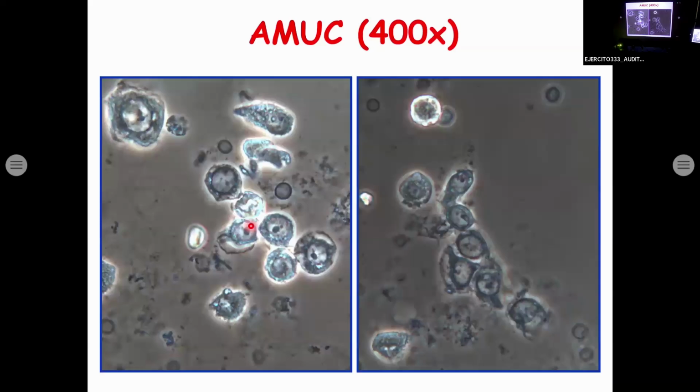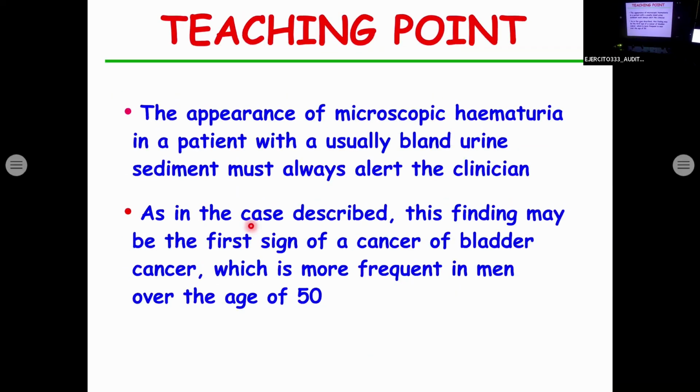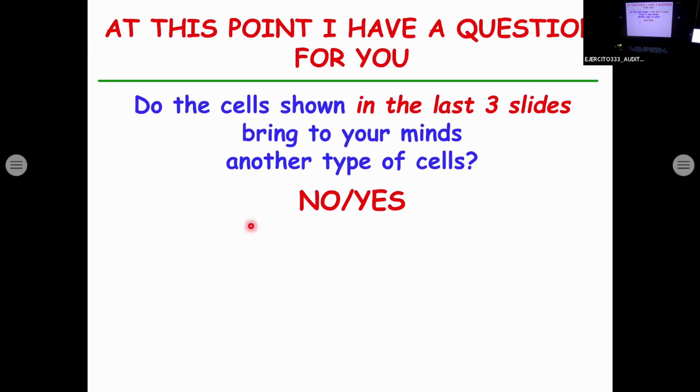These cells, in your opinion, may be misidentified or are very similar to other types of cells. Which one? I hope that an answer will come from those who participated in the practical course we ran 2 days ago with Fiorella Anghileri.